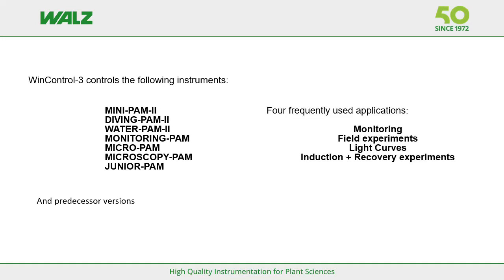Apart from a discussion of the features of the software, the tutorial will also touch on some more physiological aspects of the four main applications of the software: monitoring, field measurements, induction with or without recovery, and light curves.